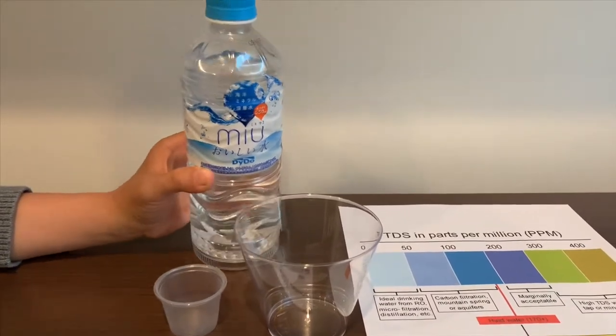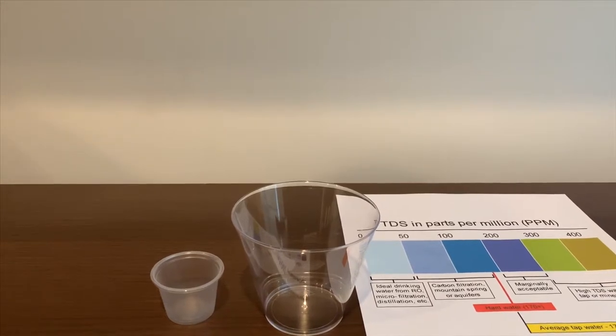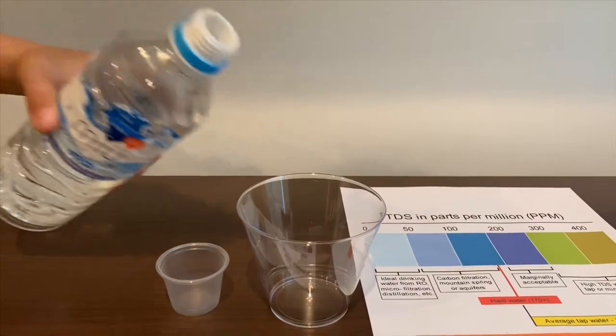Let's test the pH and TDS levels. Let's pour some water in.